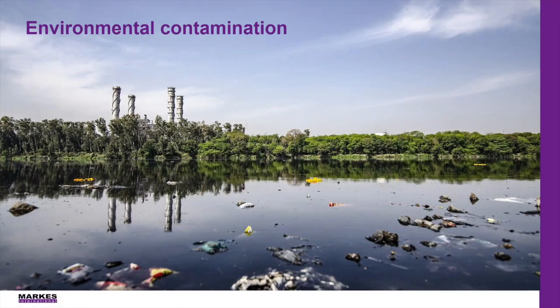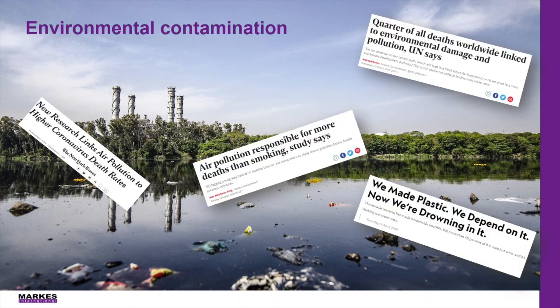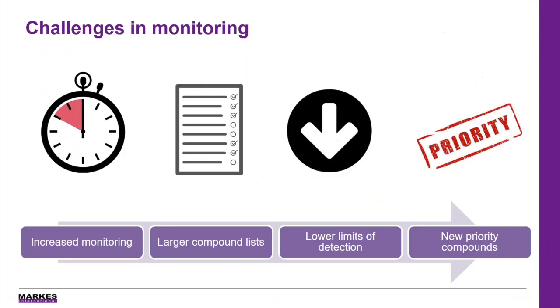Since the 1960s, there's been a growing concern about harmful exposure to low levels of hazardous pollutants. These concerns have led to tougher volatile organic, or VOC, monitoring programs worldwide, and that's resulted in a number of challenges for analysts. Analysts are now being asked to negotiate challenges such as increased monitoring frequency, larger lists of target compounds, and to reach even lower detection limits.